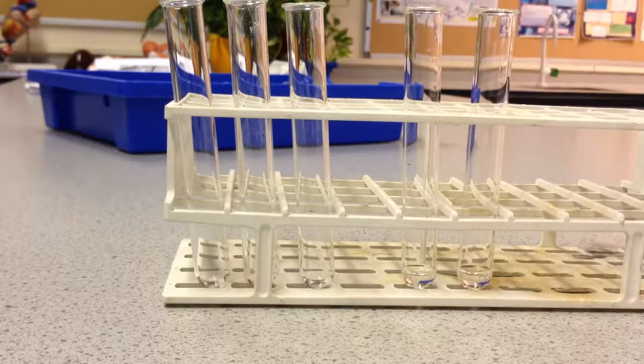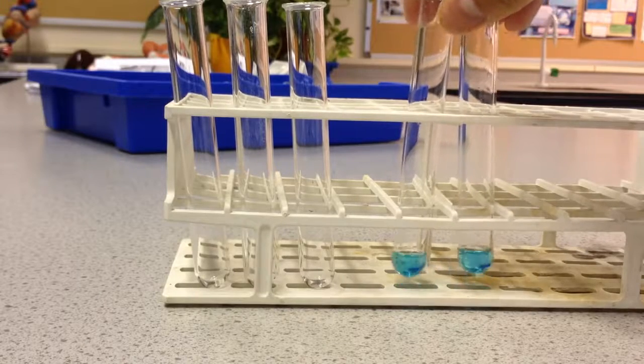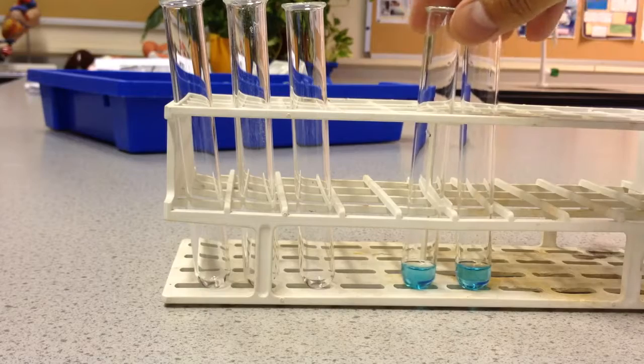Okay, and to both I will add the same volume of Benedict's reagent. And we'll now put this in the water bath around 80 degrees C for about 5 minutes.